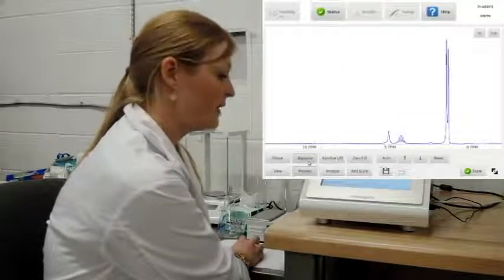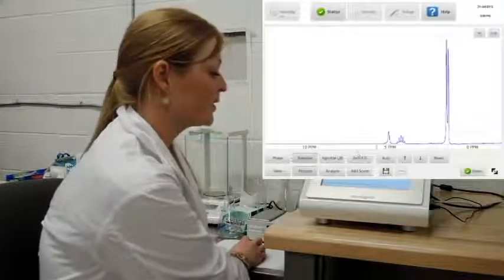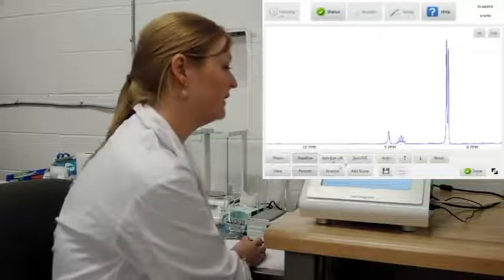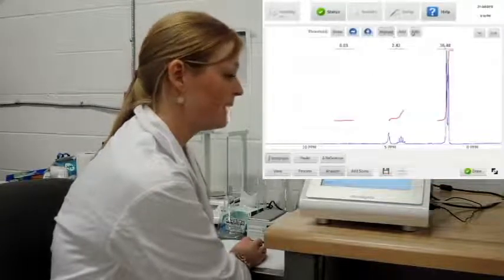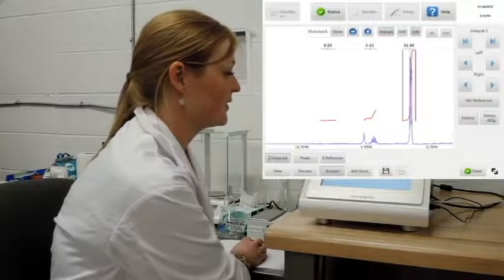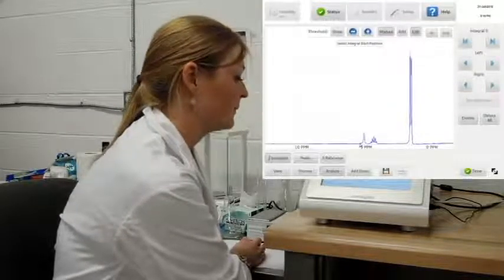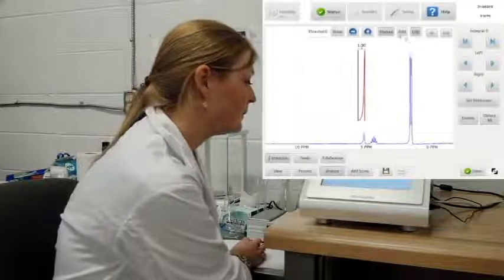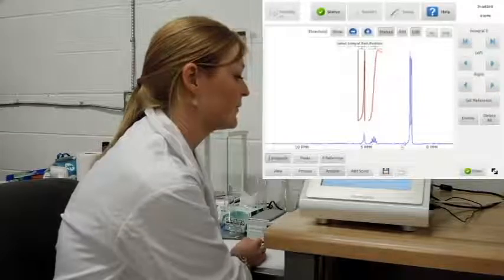Then I'm going to go to baseline and do an automatic. I'm happy with what my baseline looks like as well as my peak, so I'm going to avoid apodization and zero fill, and then go directly to my integration. It pulls up the ones I had last time, so I'm going to start by deleting all, and then adding the regions of interest here. So I'm going to pick my hydroxyl group, my methine, as well as my methyl groups.